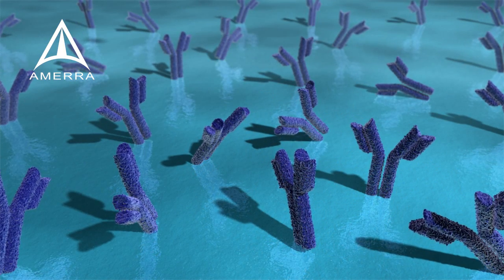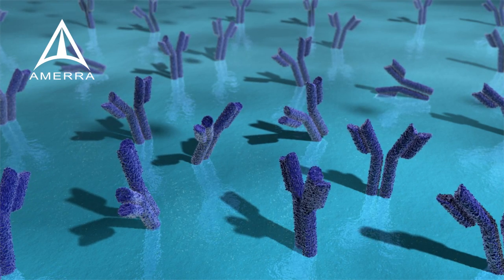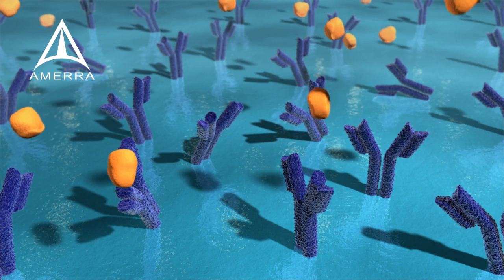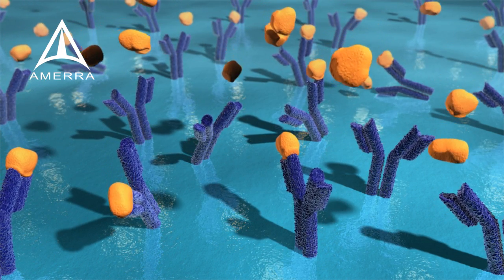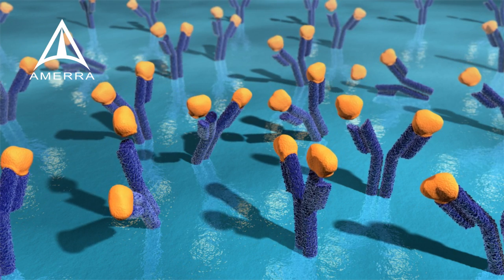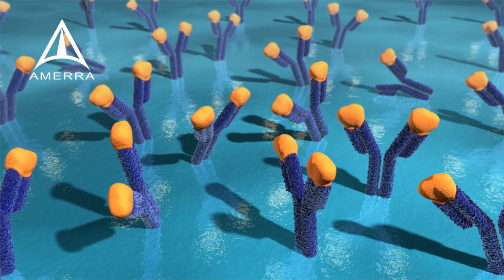In summary, Mix & Go converts almost all synthetic surfaces to surfaces that allow the damage-free binding of fragile biomolecules. The increased number of functionally active antibodies per unit surface area leads to performance improvements and cost savings, as significantly fewer antibodies need to be used to capture the antigens of interest.